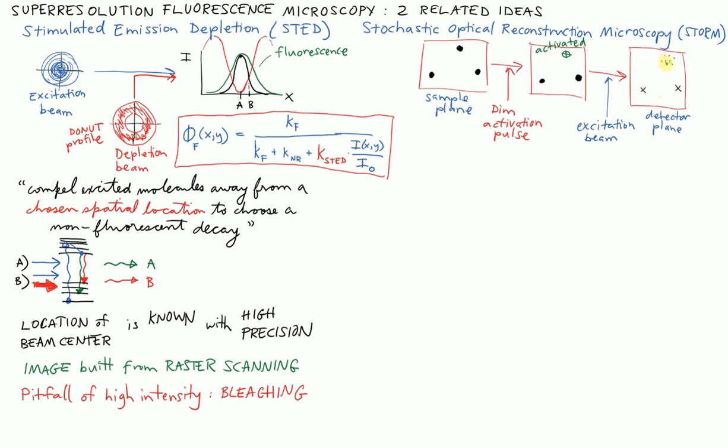but because this is an optical system, I cannot image that any more precisely than to have an airy disk, a diffraction limited spot here. So here's a whole bunch of places where there's emitted light. And I meant to draw it in green, so I'm going to redraw it in green. So here, at the proper color for fluorescence in this tutorial, is a diffraction limited spot of green light.